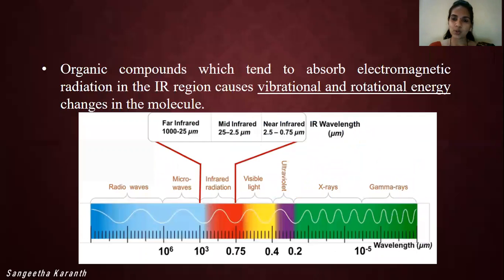So first, as we all know, IR spectroscopy involves molecules absorbing infrared radiation. Here we can see in the electromagnetic spectrum, when the molecules absorb radiation in the infrared region, then they undergo vibrations.